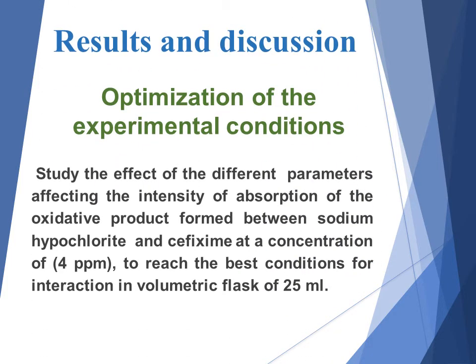Optimization of the experimental conditions. Study the effect of the different parameters affecting the intensity of absorption of the oxidative product formed between sodium hypochlorite and cefixime at a concentration of 4 parts per million to reach the best conditions for interaction in a volumetric flask of 25 ml.